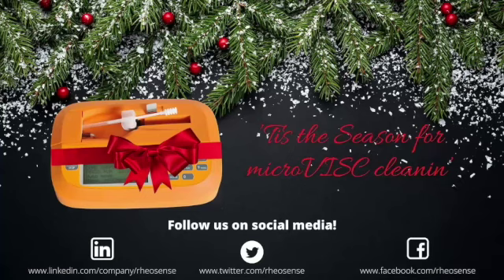So Damien, do you want to take over and tell us about the chip cleaning station? All right. We also have one more question. Is there a temperature control option?